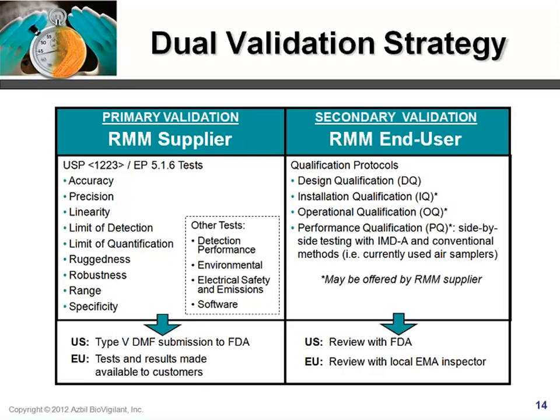However, it's worth noting that both regulatory agencies have expressed a strong interest in being involved during the validation process and data review before implementation. We've found them to be very welcoming and interested in knowing what customers are potentially looking at in terms of RMM validation, and they're very willing to give feedback and review data and help customers understand whether they're generating data that would be sufficient for any given validation.